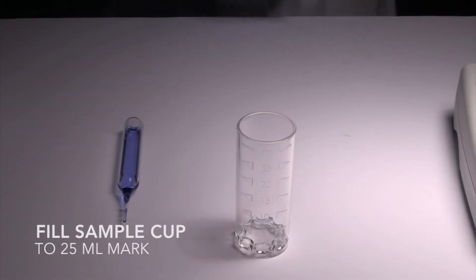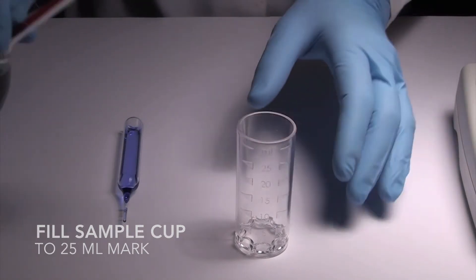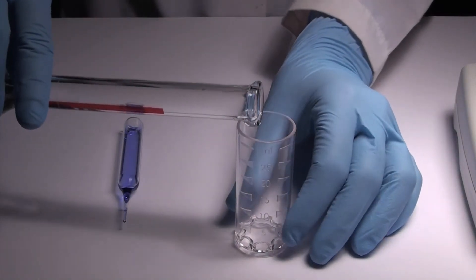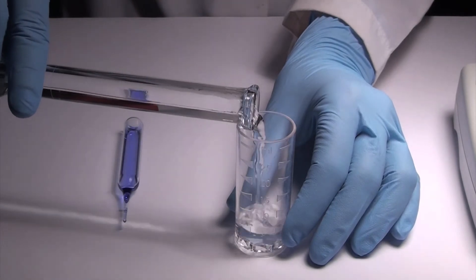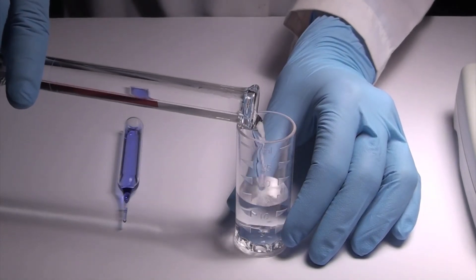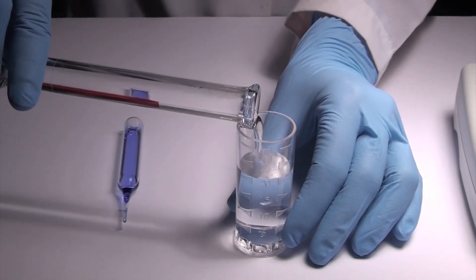Then, measure the ozone in the sample. Fill the sample cup to the 25-milliliter mark with the sample to be tested, being careful to minimize turbulence. Ozone loss from sample occurs rapidly, so do not transfer sample to other containers.